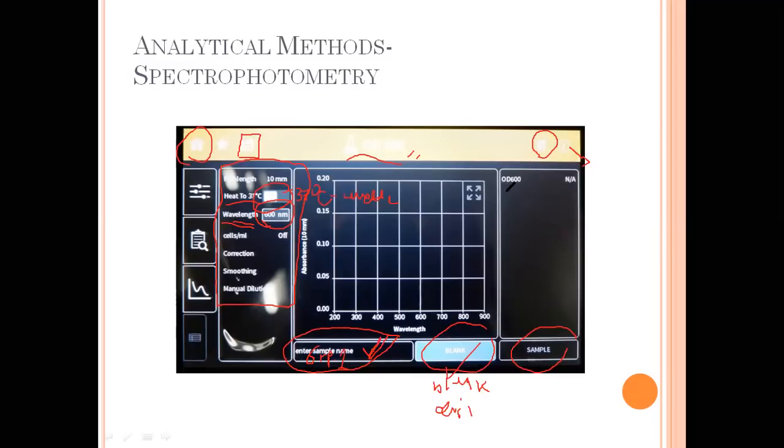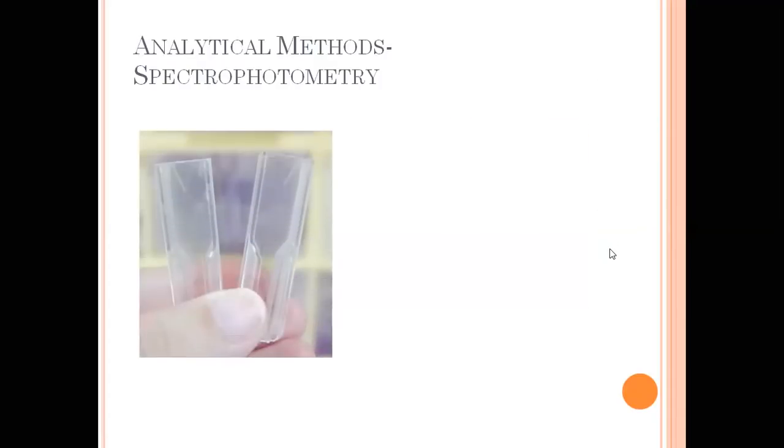So you can observe here also the wavelength that you set. So depende yan, pwedeng mag-iba yan. Depende nga sa isiset mong wavelength needed for the test. Okay? So these are the cuvettes available, or this is the actual cuvette that we use for our spectro. So kindly take note of this arrowhead present on our cuvette, because this is very important when we are measuring or when we are reading our sample.